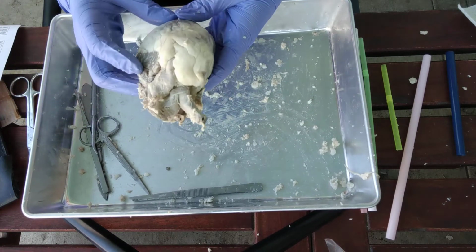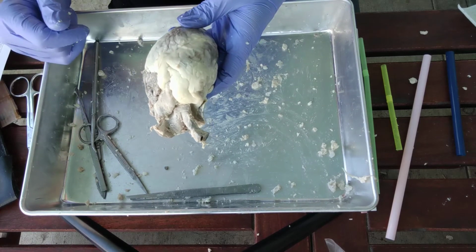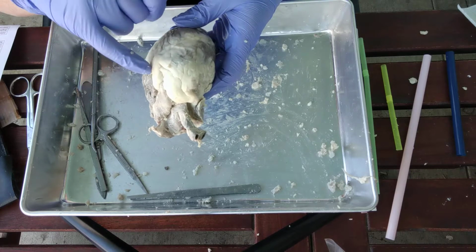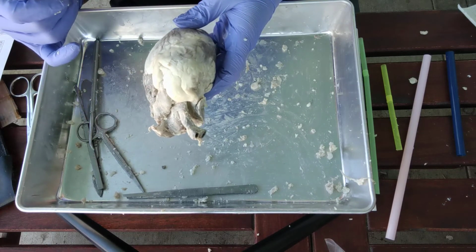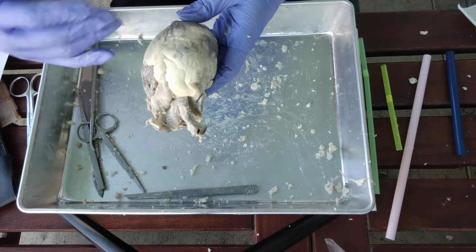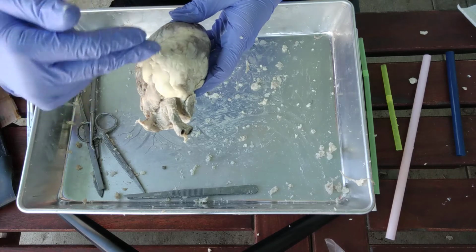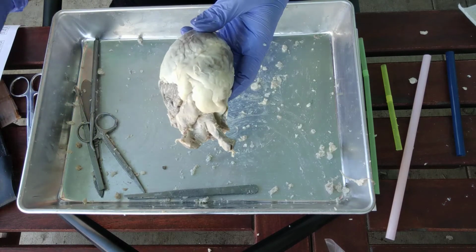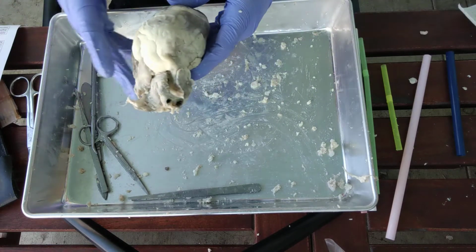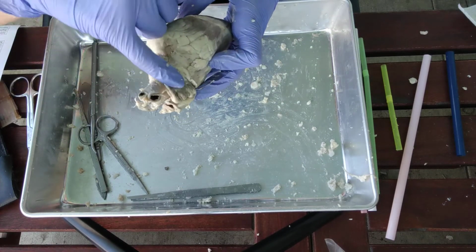Now the most important thing to do is make sure that you don't pass into the left ventricle. So remember this fat right here, this fat is sitting in the anterior interventricular sulcus, which is the groove right there. We don't want to cut through that, because then we'll cut through the anterior interventricular septum and go into this ventricle, and then it'll be really confusing and hard to look at. So make sure that you're only staying on the right side.